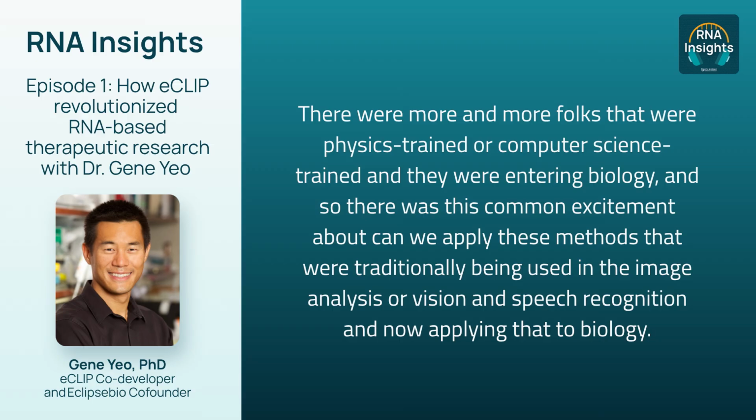Right. I think the impetus for this was the idea that we wanted to map the regulatory elements bound by many RNA binding proteins in human cells. I think the grants that we put in may have been a bit more ambitious than we had thought. So I had at that point applied CLIP, or HITS-CLIP, which was originally developed by Bob Darnell's lab at the Rockefeller Institute, and we had applied it in 2008 or 9, and then we started applying this to a family of RNA binding proteins known as the hnRNP family of proteins.